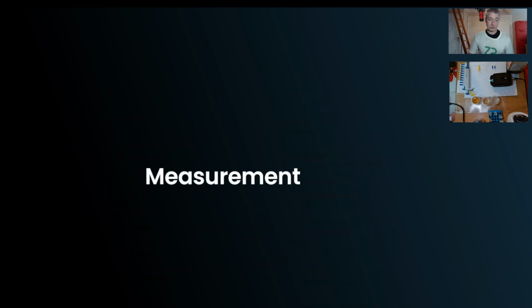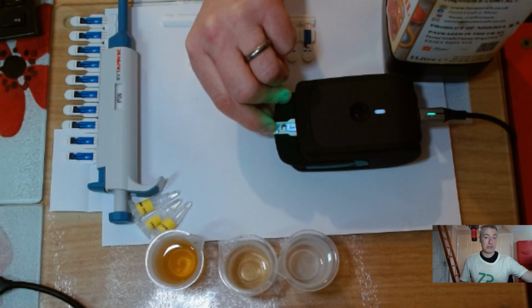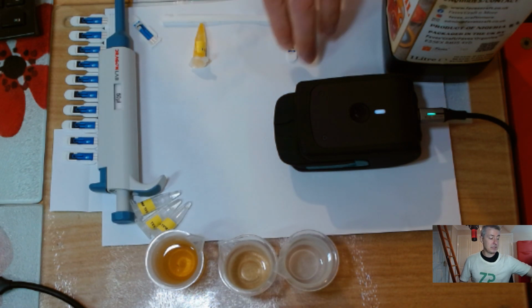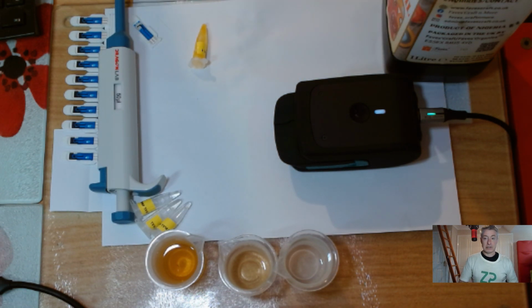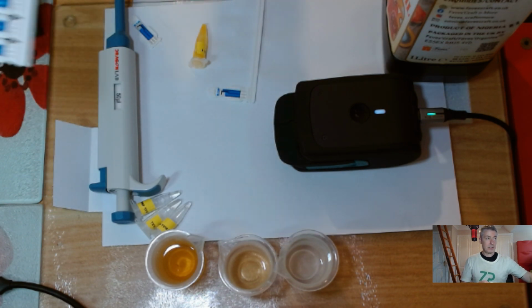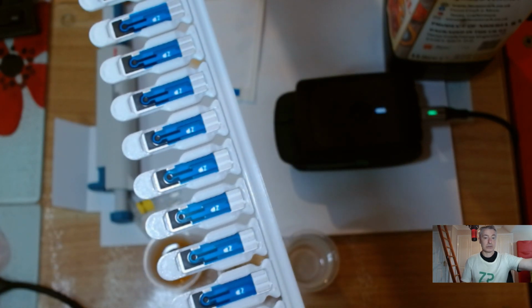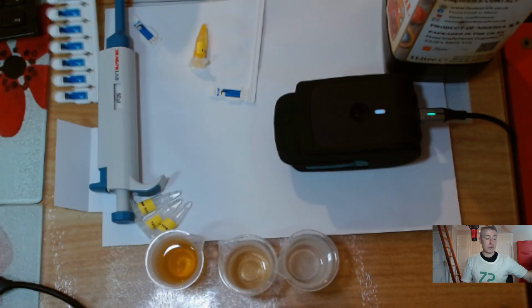So let me talk you through the measurement. I'm going to take one of our ZP electrodes. I've got a couple of electrode types here. If you're doing academic R&D, it's sometimes easy to use our circular electrodes. I think that's called the 501.